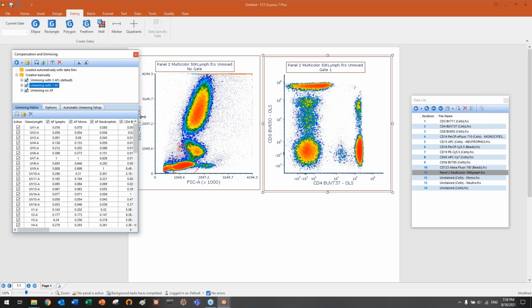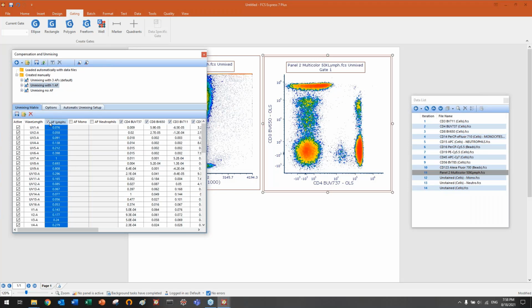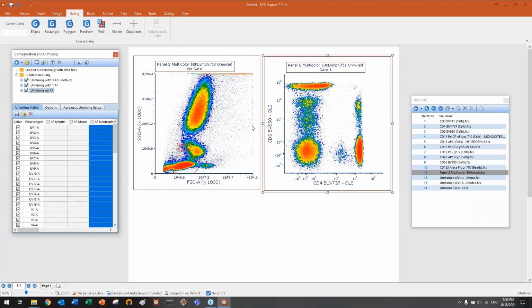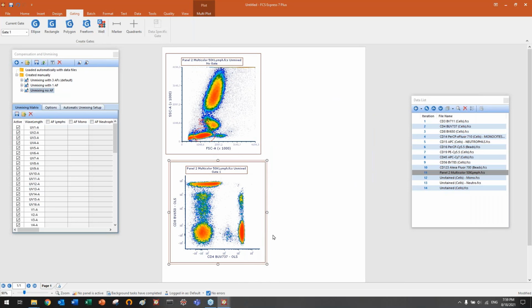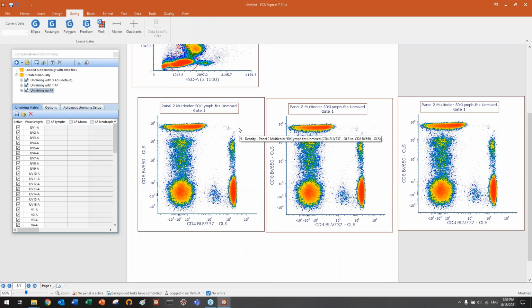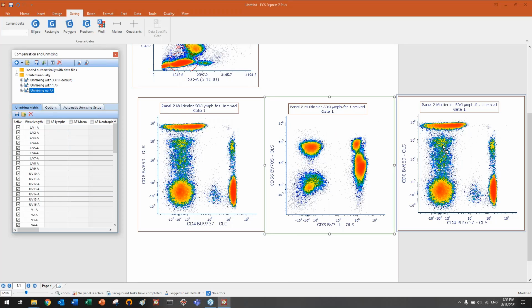Now, if I go here, I can simply uncheck. You see the column, and maybe just keep this one, or maybe just keep this one as you want. This is good to switch off and on multiple or even a single end member. And here I should uncheck, uncheck, uncheck. Now I can simply create like 3 copies of this plot, like Control D, if I want to compare. And then I can drag and drop. So I will drag and drop this one here, 1AF here, and here.